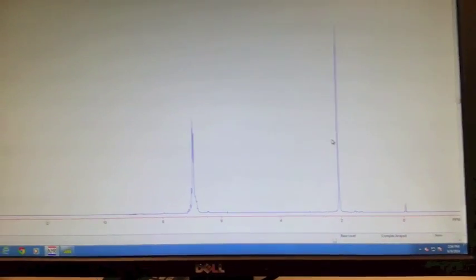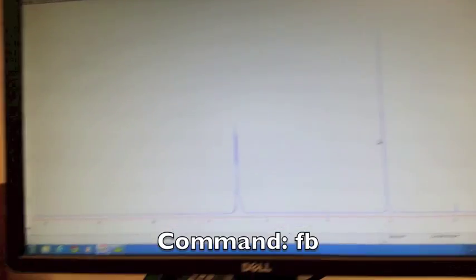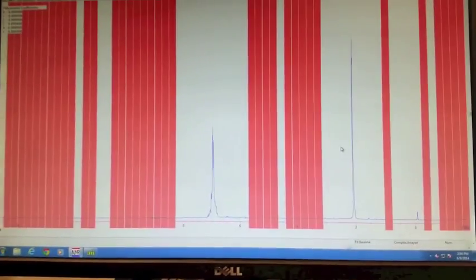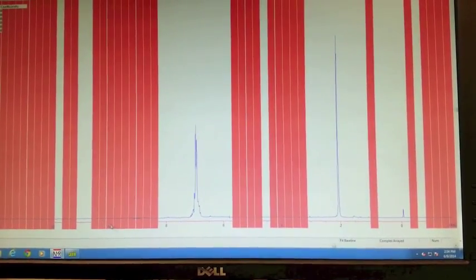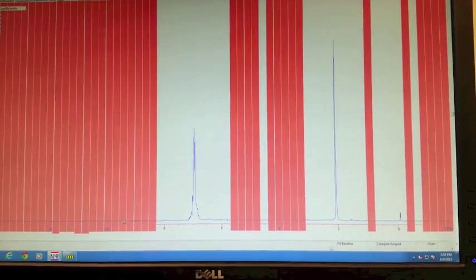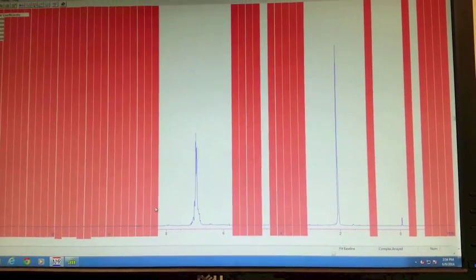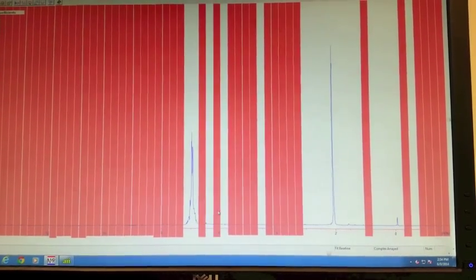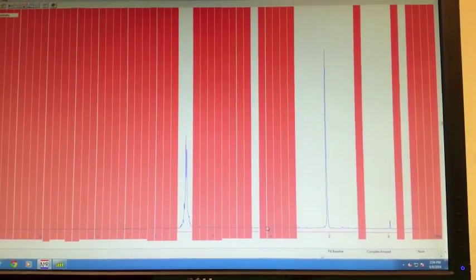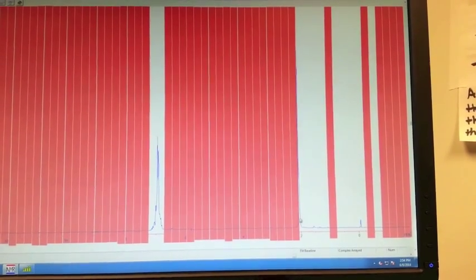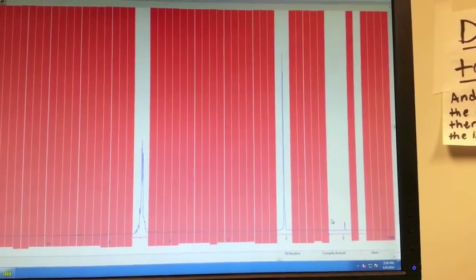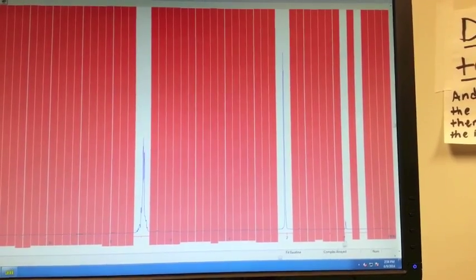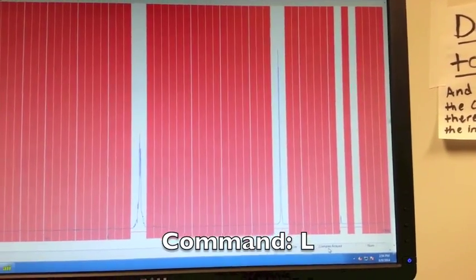The next command you want to enter is to fit the baseline, which is FB. In this command, you want to make sure that there's a pink box anywhere there is not a peak. You can just click to add or remove a pink box anywhere there is not a peak. Then you want to type L and hit enter.